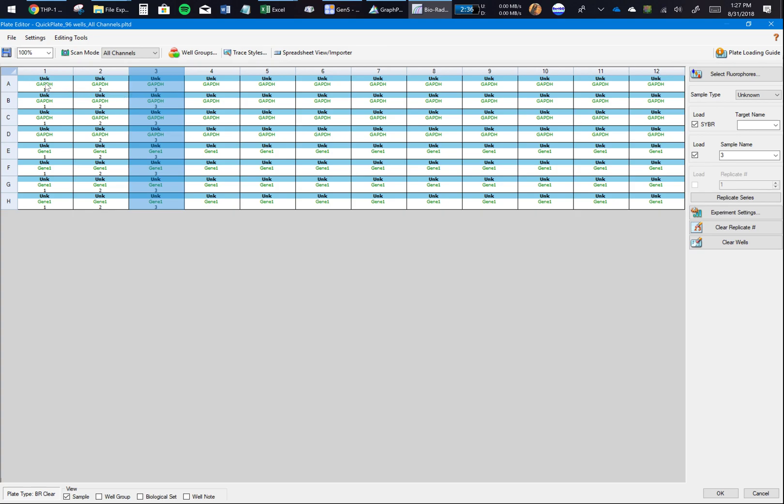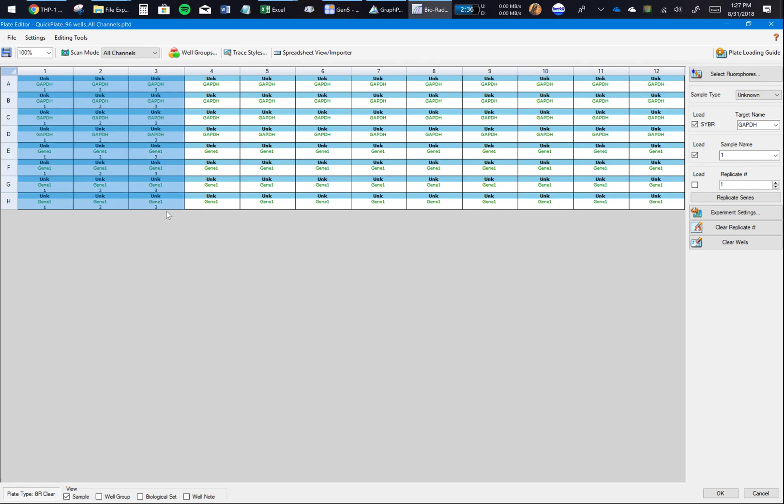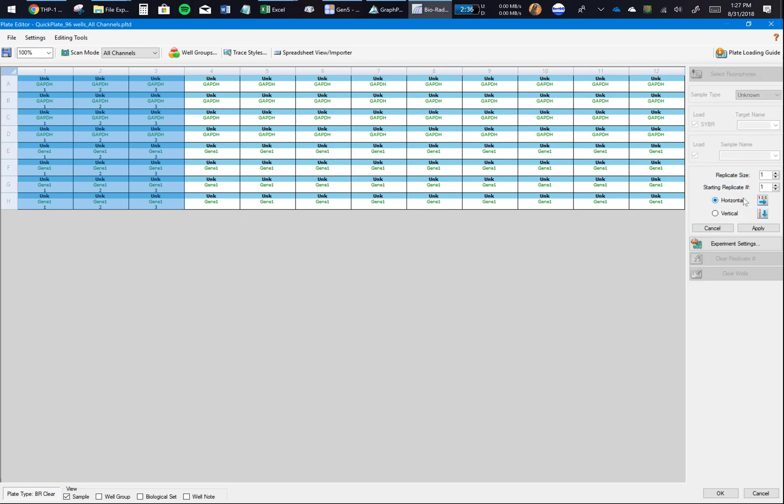Let's say I have 12 different samples, each in different columns, so I will select this column. Next part after selecting a target is to select the sample. The sample is the source of your RNA template.